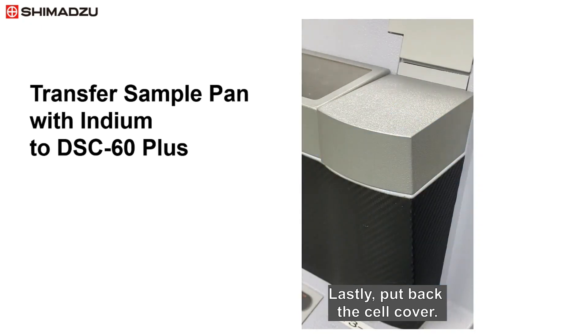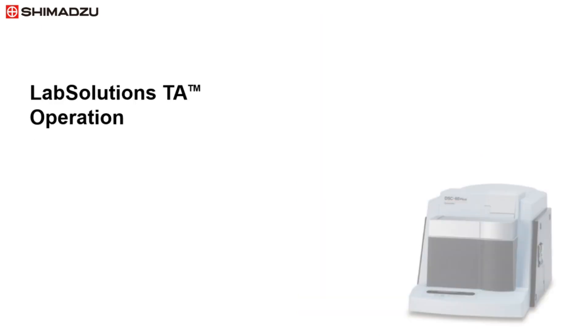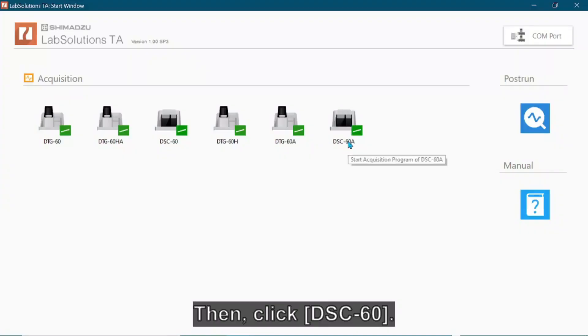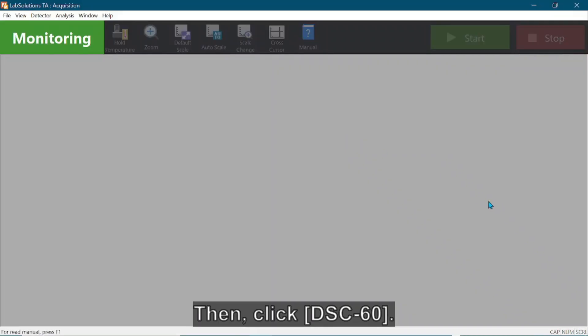Lastly, put back the cell cover. The DSC-60 Plus operation is controlled by the LabSolutions TA software. After switching on the DSC-60 Plus, TA-60WS, and PC, double-click the LabSolutions TA start window icon on the desktop, then click DSC-60.